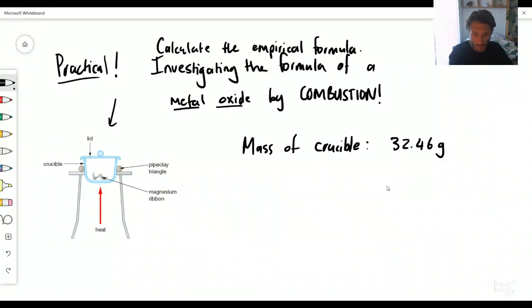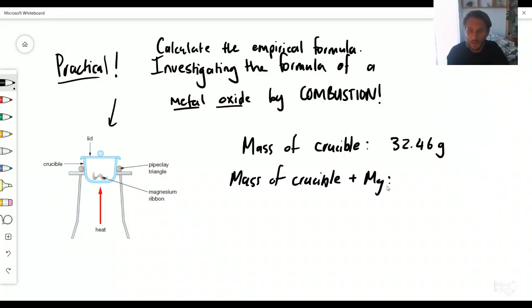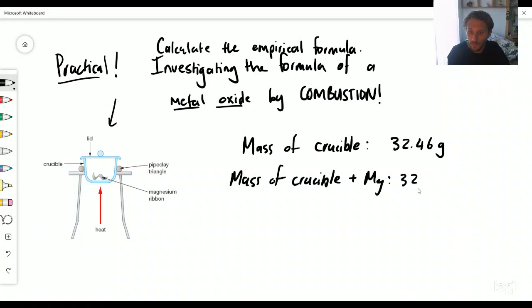Then I put my magnesium inside. So the mass of the crucible plus the magnesium - it's obviously going to weigh more, right? How much more will it weigh? Well, we can weigh 32.70 grams. We haven't done anything, we haven't lit the Bunsen burner. We are just measuring what is the mass of magnesium, and you can quickly do a calculation by subtracting these two numbers: 32.70 minus 32.46.